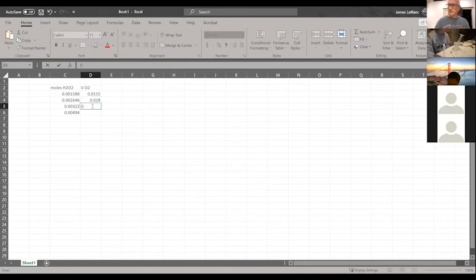It's going to be really easy to make a mistake here because there are all these 0.0s, and 0.00 and 0.000 and all that. So you have to be really careful that you're getting the units right. So, just to liters. Okay. So I want to plot moles versus liters.